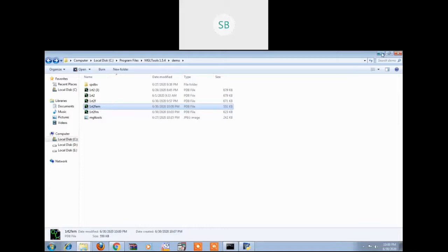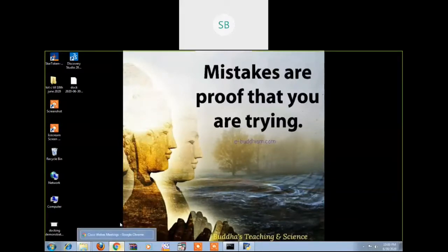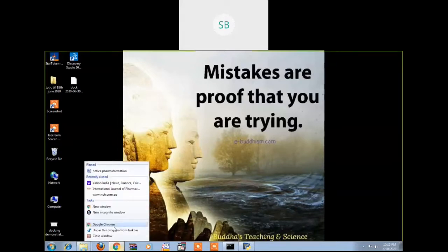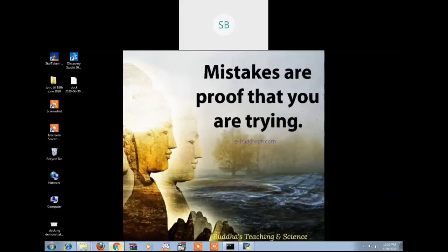So let us just fetch nevirapine from the net, right? Okay, let us see whether nevirapine is there or not, right? Okay, let's just go to this Google Chrome, right? Okay, why is it not opening? It's supposed to open. What happened to this? Okay.